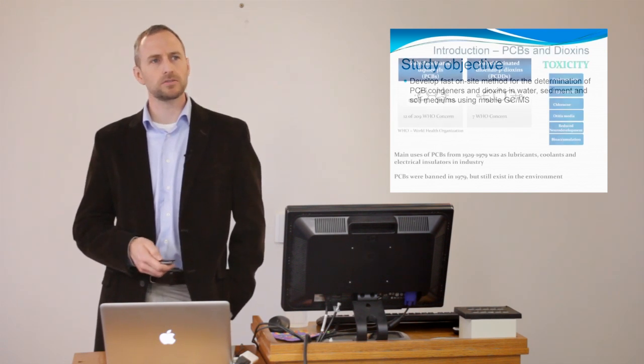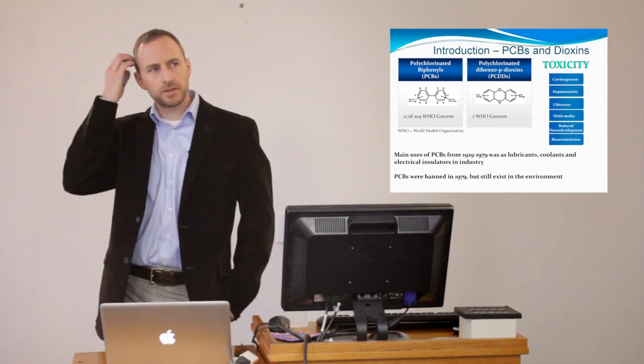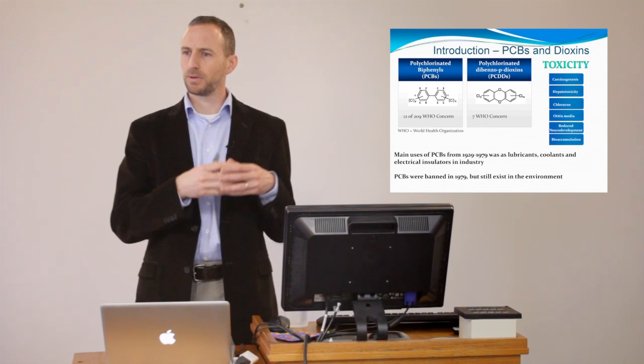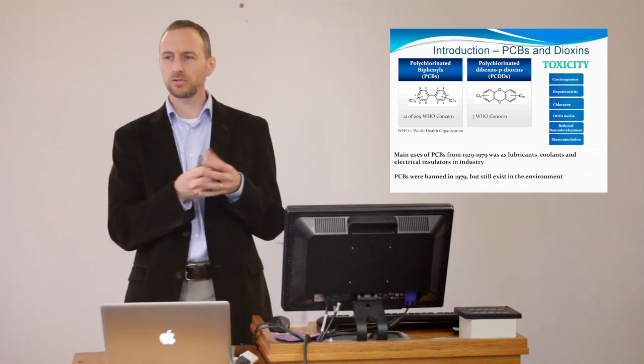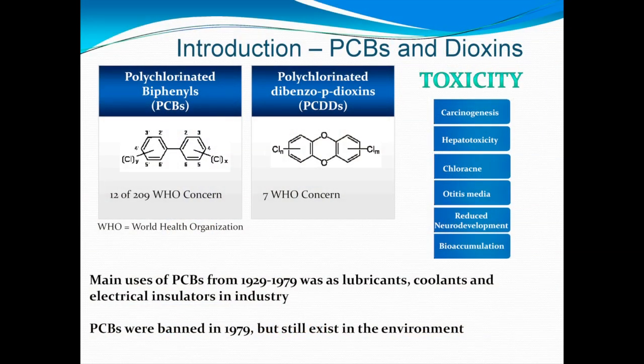or GCMS. A little bit of an introduction to PCBs just to make you familiar with the difference in terminologies we're going to be using between PCB congeners, which are specific compounds, and aroclors, which is a mixture of PCBs. And so most importantly, what is a PCB?